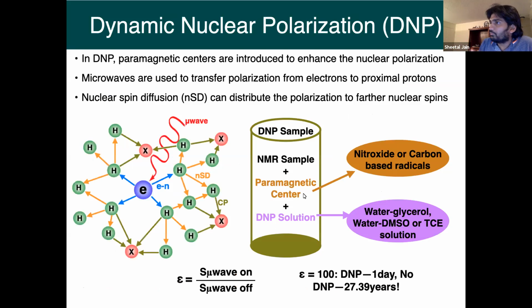So just a brief introduction to DNP. This is a technique, probably most of you are already familiar with it, that is being rapidly used nowadays to enhance the nuclear NMR signal by orders of magnitude.